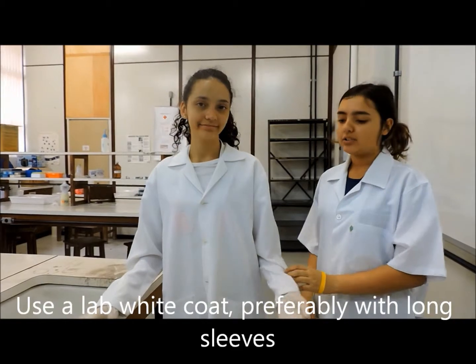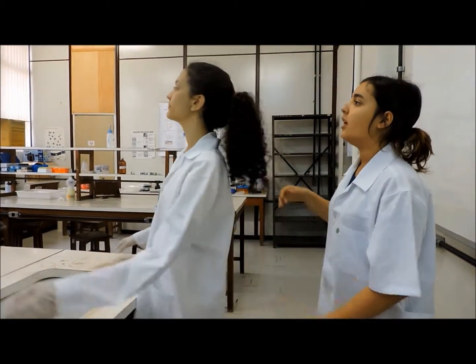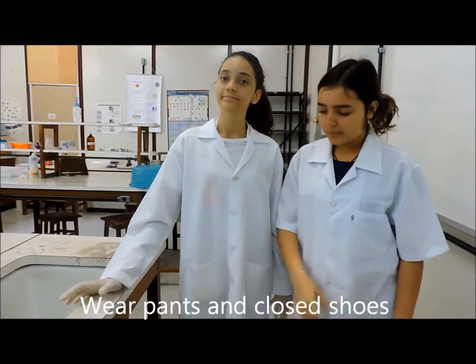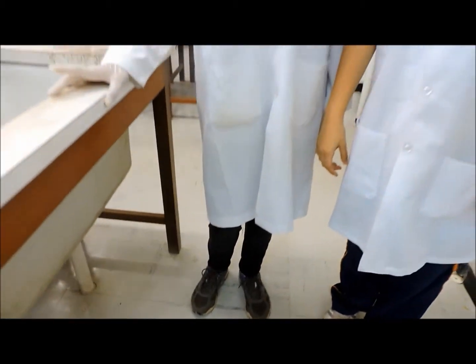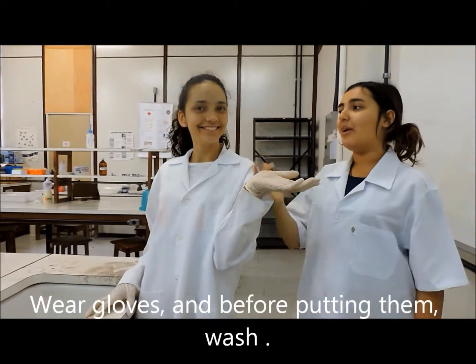Use a white lab coat, preferably with long sleeves. Hold her hair back with something. Wear pants and closed shoes. Wear gloves, and before putting them on, wash your hands.